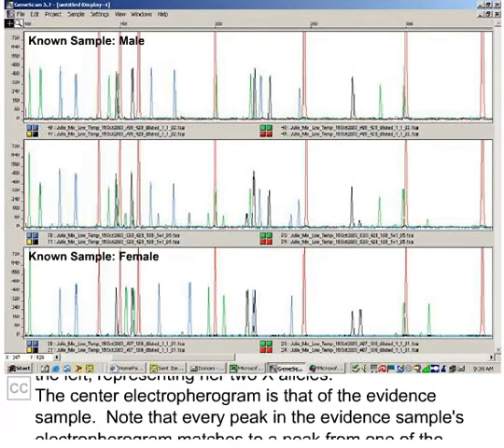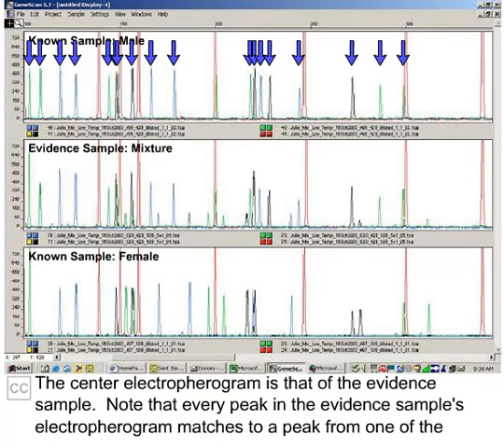The center electropherogram is that of the evidence sample. Note that every peak in the evidence sample's electropherogram matches to a peak from the electropherogram of one of the two known samples, indicating that those individuals could not be excluded as being the two contributing sources of the DNA found in the evidence sample.